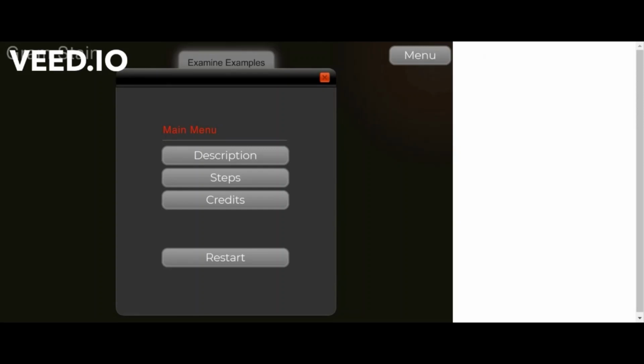Good morning, sir. Today I'll be doing 4 simulations, and I will start out with the gram staining simulation. The gram staining is a concept of differential staining, and it is used to categorize microorganisms into classifications such as gram positive and gram negative.